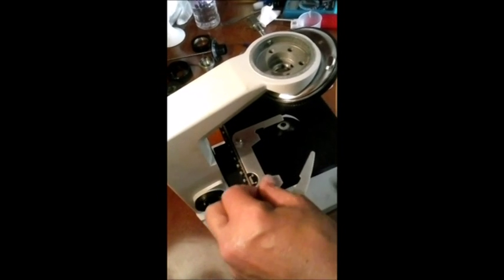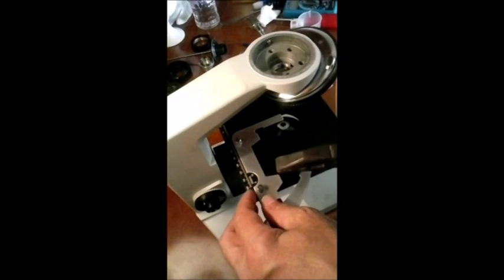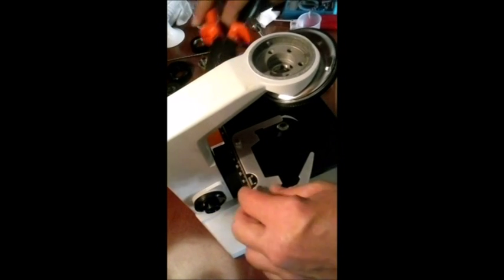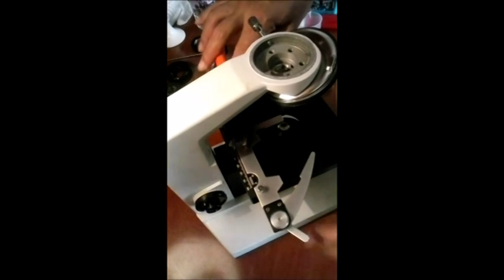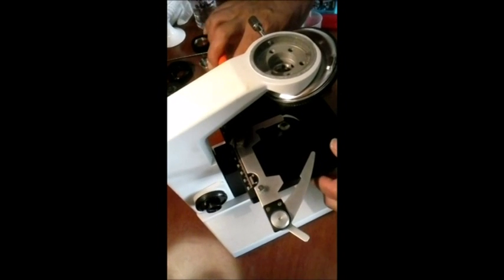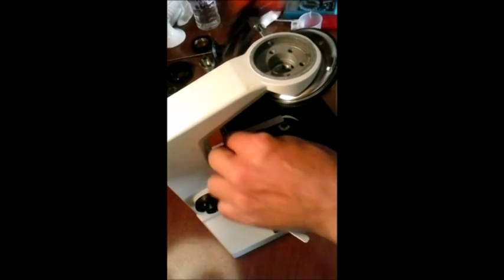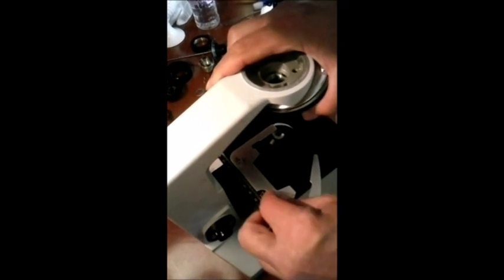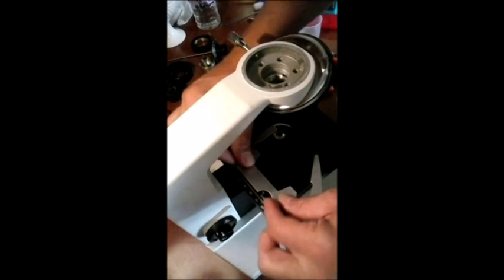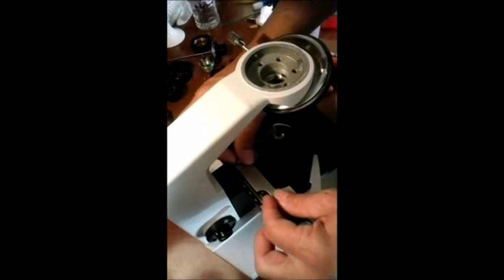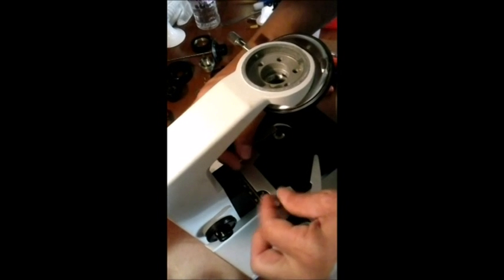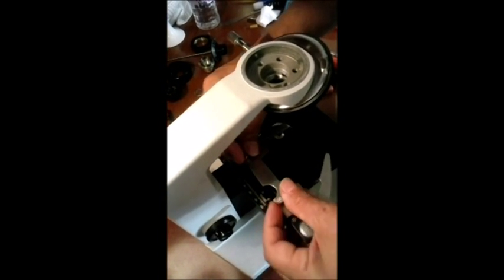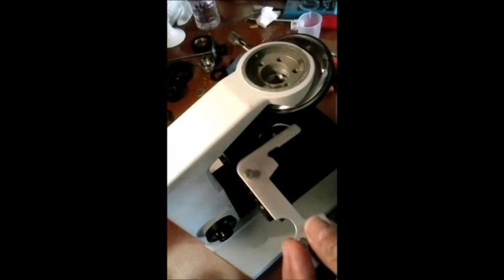Nesse momento, então, pegamos o alicate, ok? E vamos desafrouxar aqui, que está bem apertado. Não tem necessidade de apertar isso tanto. Mas é o tal negócio, senhores. Vamos soltar. Isso daí, simples e fácil.